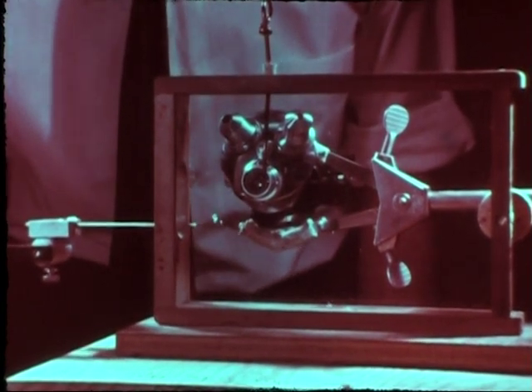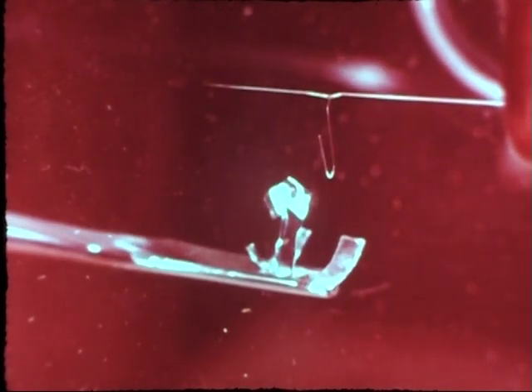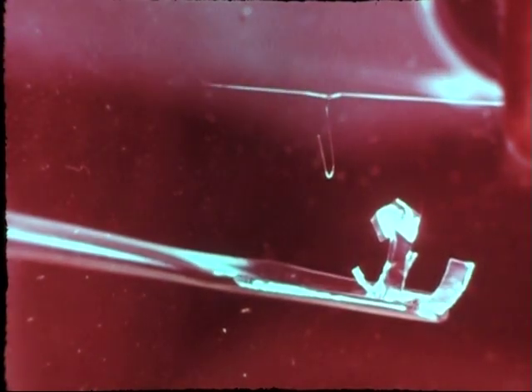The quartz fiber balance used in weighing was designed and built by Burris Cunningham. It consisted of a very thin quartz fiber anchored at one end and glass enclosed to protect it from air currents.